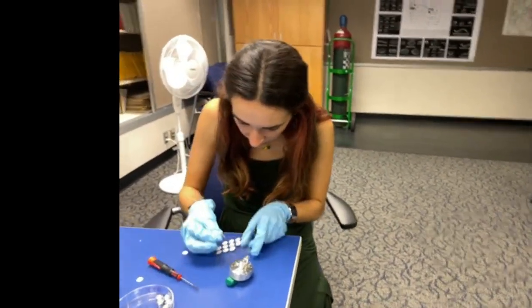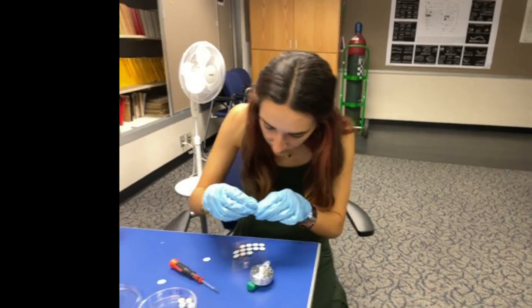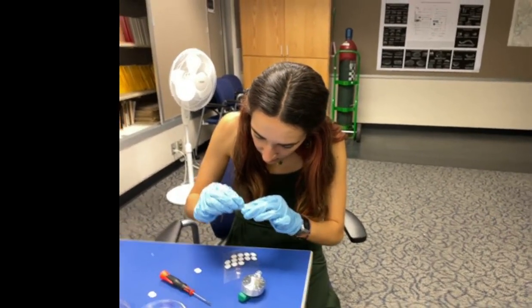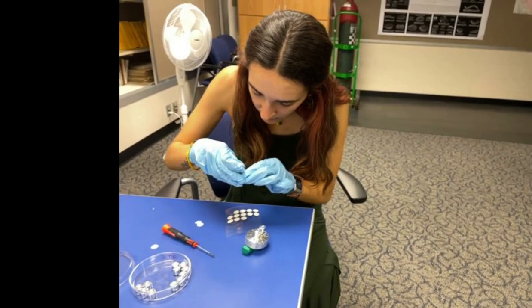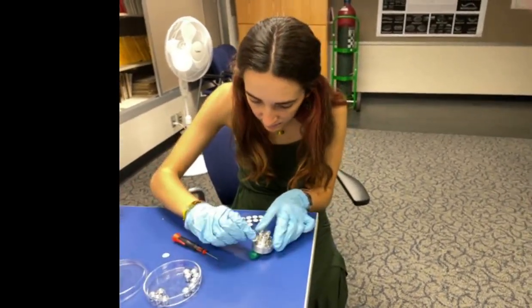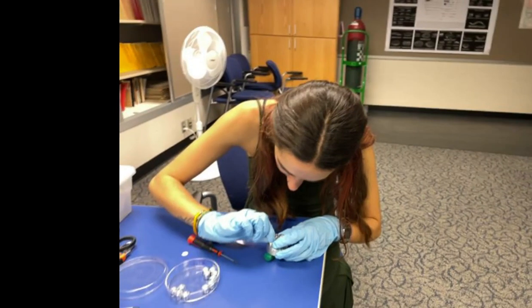So usually when that happens, especially when neither Mark nor I could find anything remotely similar to it, it's a good idea to find more than just one specimen. Make sure it's not some sort of weird circus freak individual or something that isn't easily explainable. Yeah, it's a mystery diatom, and we want to try to solve it.